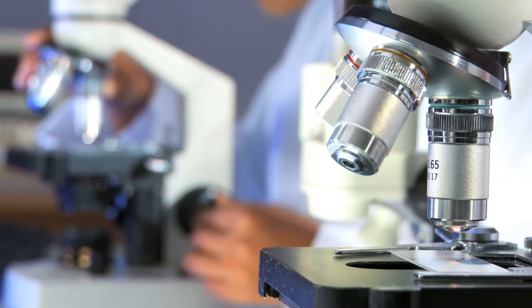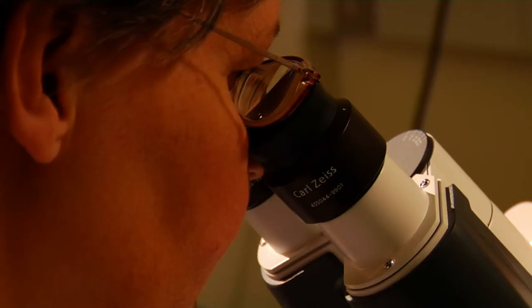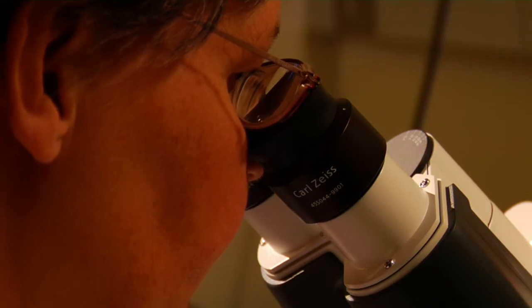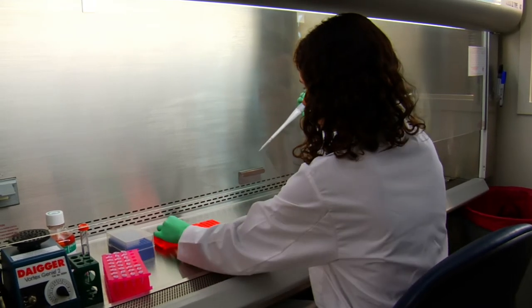The Primer is ideal for confirmatory studies of a specific cell line or media formulation. It provides the flexibility and efficiency your team needs when pursuing a promising lead. Like all of BioVest's instruments, the Primer is scalable, adjusting up or down to the size of the required workload.